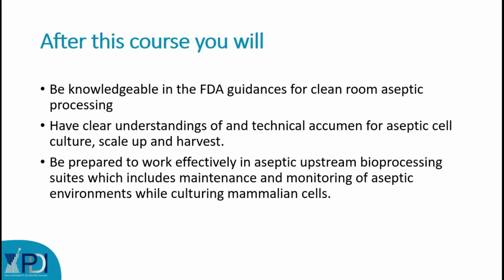So after this course, you will be knowledgeable in the FDA guidances for clean room aseptic processing. You'll have a clear understanding of and technical acumen for aseptic cell culture, scale up, and harvest. And be prepared to work effectively in aseptic upstream bioprocessing suites, which includes maintenance and monitoring of aseptic environments while culturing these mammalian cells.